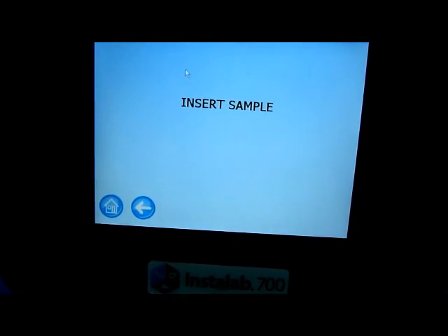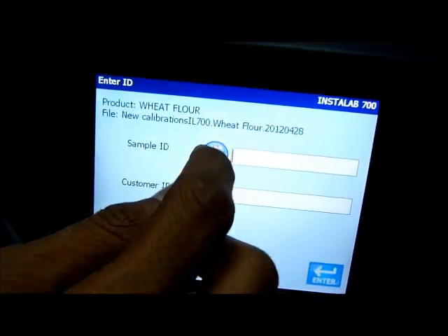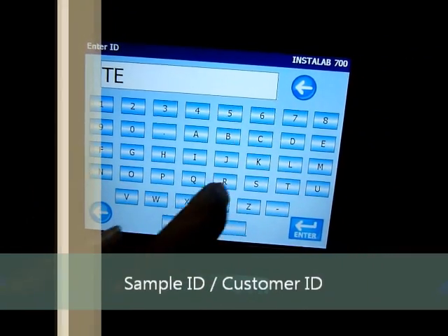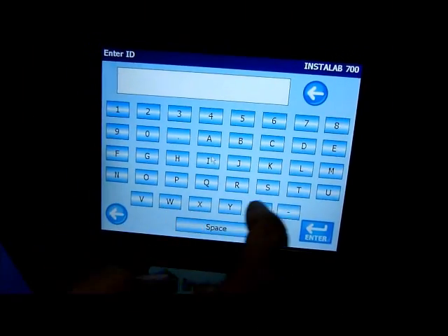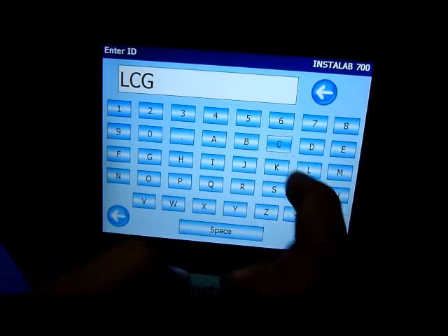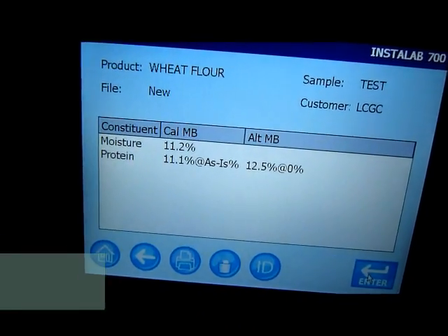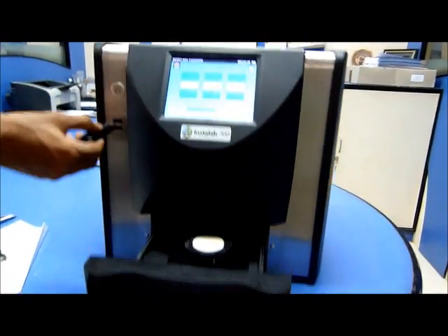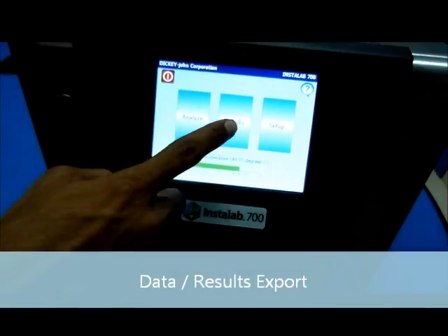Prepare your sample. Now you can see the method of analysis in the IL700 system. Place the sample in the drawer and select the product for analysis — in this case, the wheat flour sample. The system checks the ceramic cup reading, which is used as a reference disk reading. Once the reference reading is taken, insert sample will be displayed. Close the sample drawer.